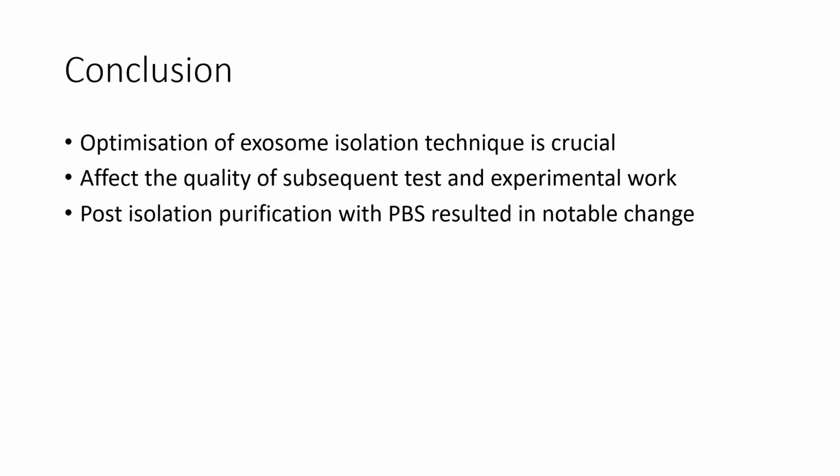In conclusion, we could see the significance and importance of optimizing the exosome isolation technique, not only with ExoQuick reagents, I believe, because it affects the quality of the subsequent tests and experimental work, which might affect the effectiveness in diagnosing a disease as well. In my case, post-isolation purification with PBS gives notable differences between before and after purification.